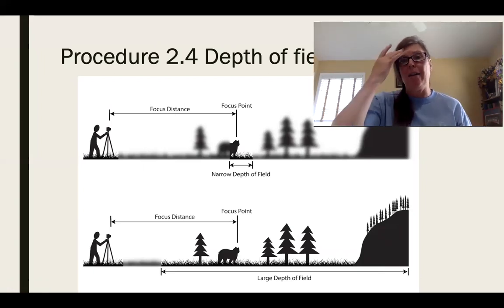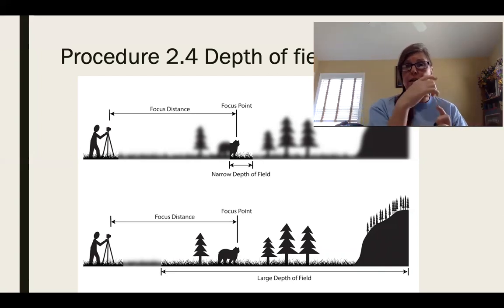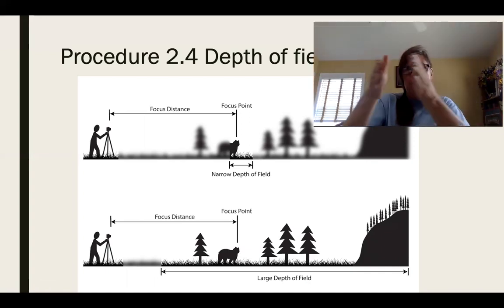Of course many of us use our phones now, but if you had an old school camera where you had to adjust the focus, one of the expensive ones, you would know it depends on where the object is as to what's focused. So in this case, we can see that we have this much in focus, versus here we have a lot more in focus. It's kind of like saying, if we zoom in, we have to pick our depth we're going to focus in. You can see this when you watch movies.